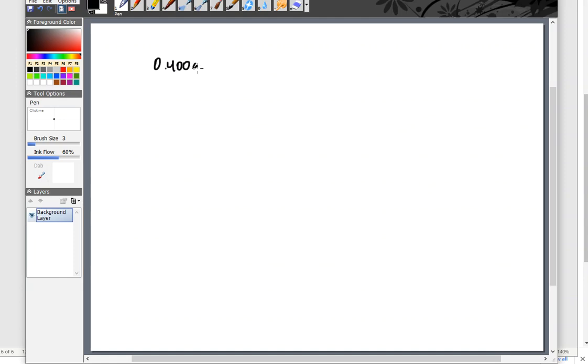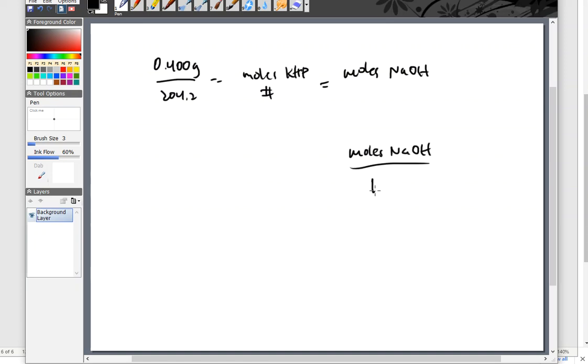I'll take the mass of KHP divided by the 204 point blah blah blah, whatever it was, the formula weight, in order to get moles of KHP. Well, that number is also equal to the moles of NaOH. We already said it was a one-to-one relationship. I have that one. I know how many moles of NaOH it took to neutralize that. Once I have moles of NaOH, I'm then going to divide that by the liters of NaOH that it took from the burette. The key here, though, is that your burette reads in milliliters, so you need to convert that to liters.